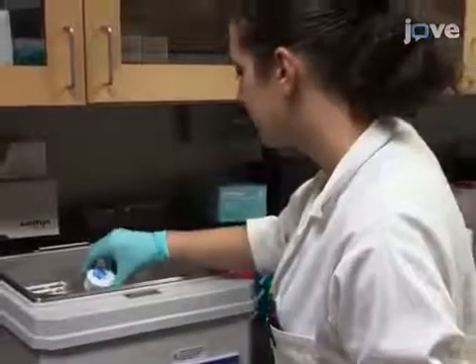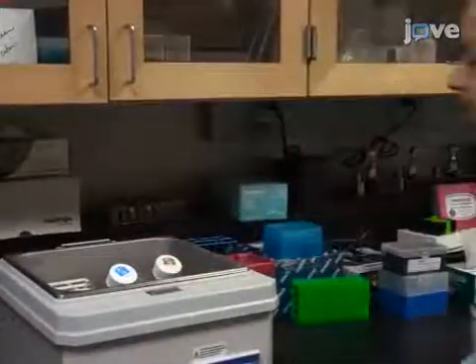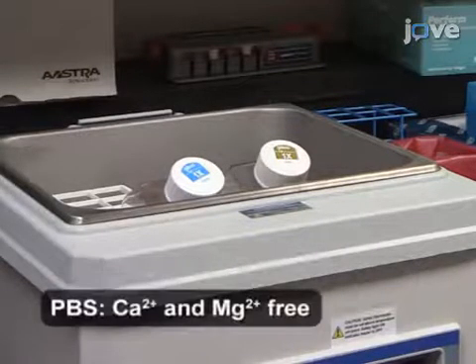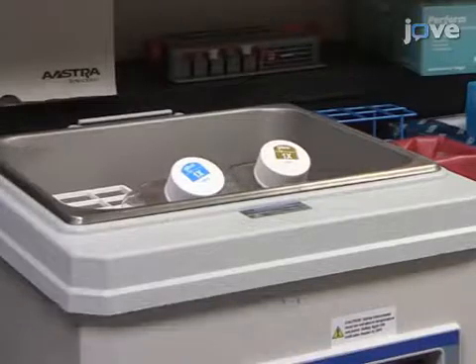After collecting and analyzing particles according to the TEXT protocol, carry out particle exposure by warming complete growth medium, 0.25% trypsin, and PBS in a water bath at 37 degrees Celsius for at least 30 minutes before culture initiation.